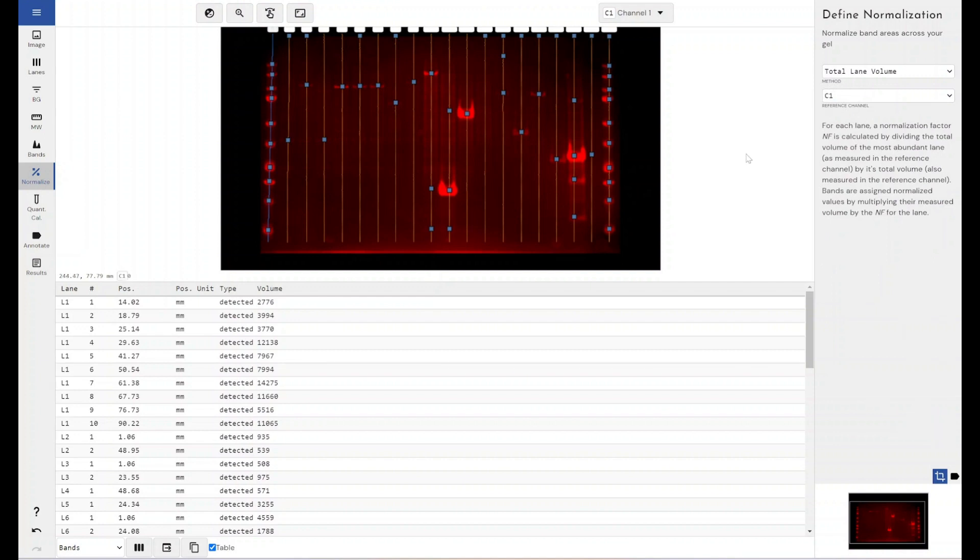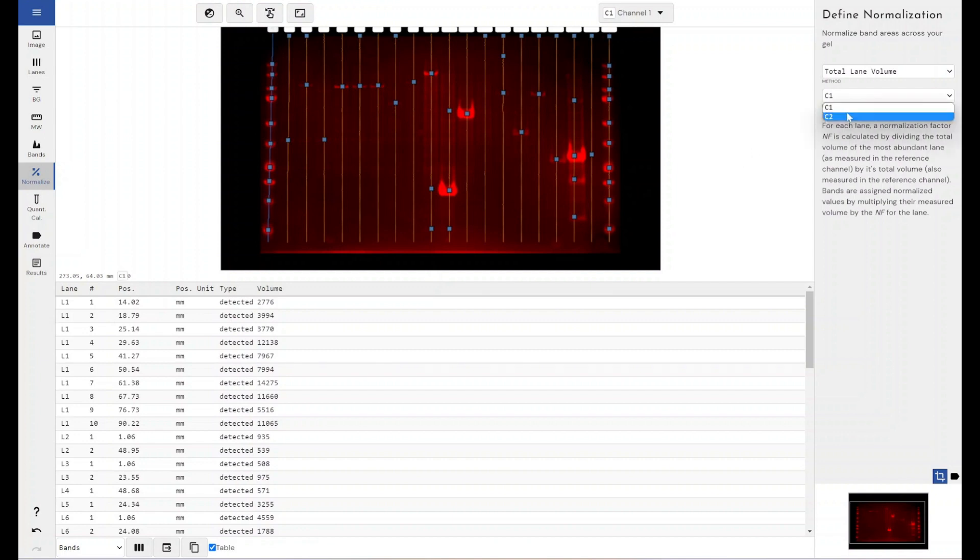Without going too deep into the mathematical functions that are at play here, but we do cover those within our help manual if you did want to dig into how this is determined. The software will use the reference channel that you've given it, which would be your total protein stain, and it will work out the total protein volume within an entire lane and compare that to the band that you've got on the other channel to represent and normalize your protein of interest as an expression of total protein within the sample that you've been using.